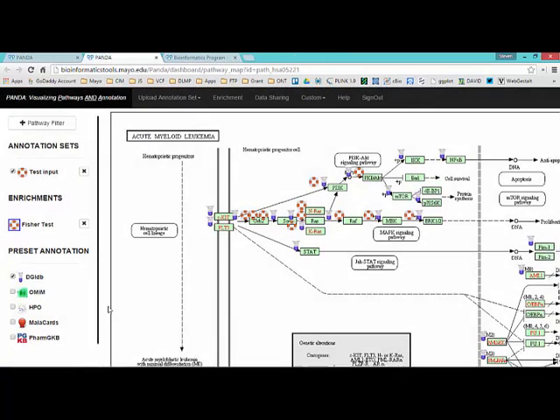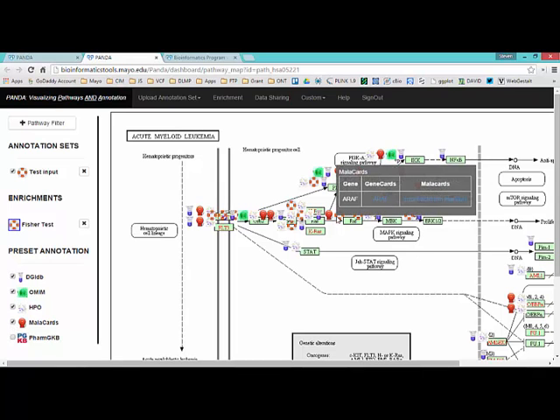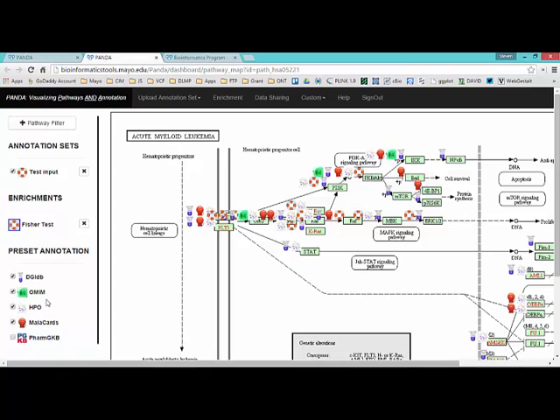So that's just kind of handy to help you sort through and find relationships that may or may not be apparent. But as you can see, as I get too many of these in here, it becomes very difficult to sort out. And so that's really where you can take advantage of this toggling feature to just add or remove the different annotations you want to see or don't want to see. And that helps clarify the visual field.